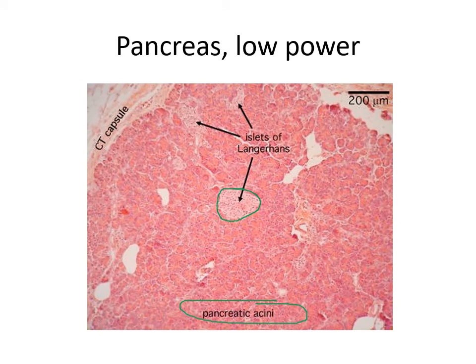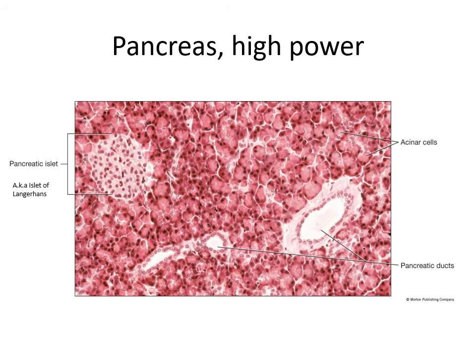So that is the pancreas's exocrine function. Here's another example — you can see the acinar cells quite clearly on this image. Those are the cells producing the enzymes; that's the exocrine function, secreting those enzymes into the duodenum. Over here we have an islet of Langerhans — that's producing insulin and glucagon. That's the endocrine function of the pancreas.